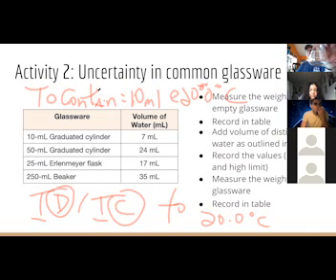Because this also has writing on it too. Nowhere does it say TC or TD on it, because this is also not a measuring device. It just isn't. So the only reason these two measurements are on here is to give us an idea of whether it's half full or it's full. That's it. So we don't use it to measure. We use it to hold things for reactions.